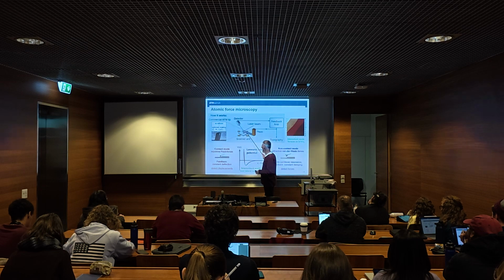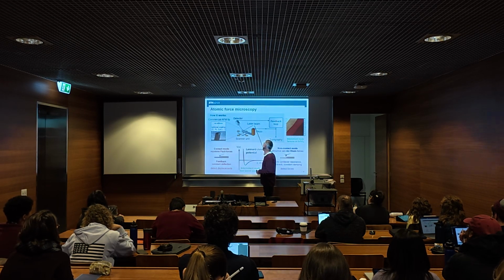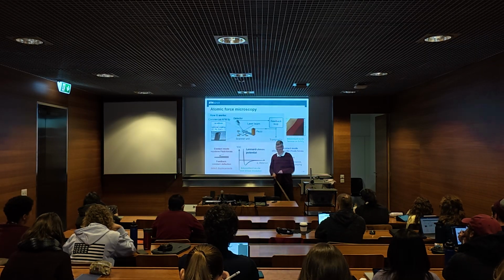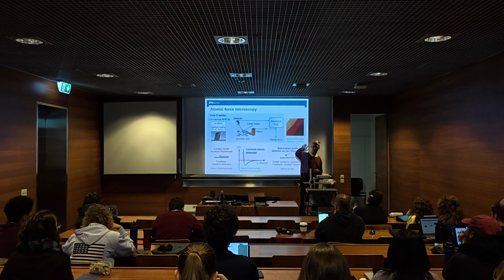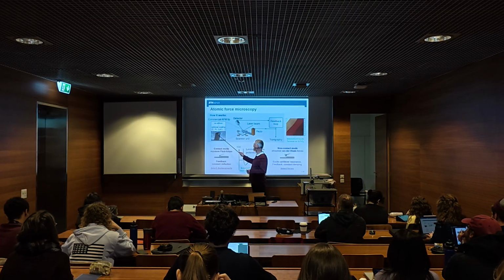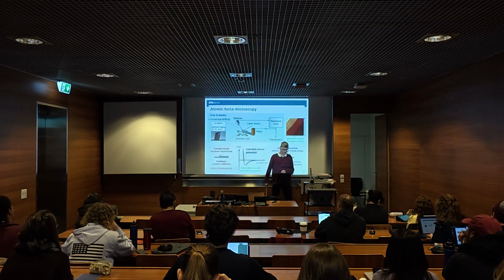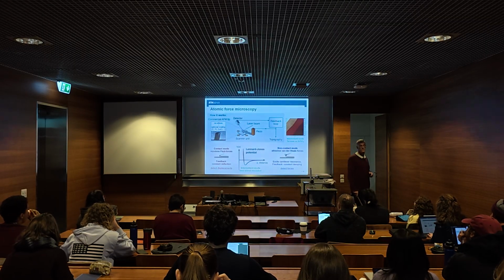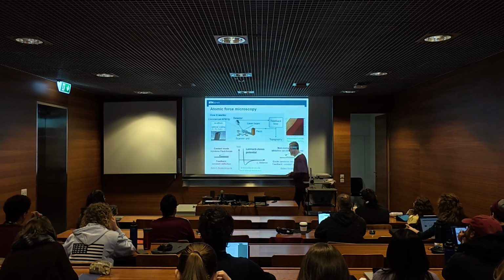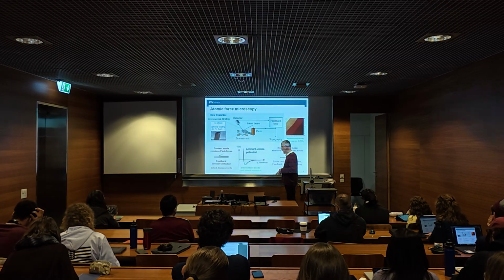How do you see that? The lever moves because you send a laser beam onto the lever, it's reflected onto some diode. Laser beam, diode, and then wherever the spot ends tells you if the lever on which the tip sits is moved in one or the other direction. So you can measure the interaction between the tip and the surface through the deformation of that lever, which is detected by this laser reflection experiment. And that's quite effective because it's a very sharp potential that determines the interaction between the surface and the tip.